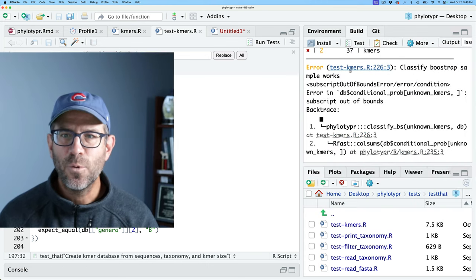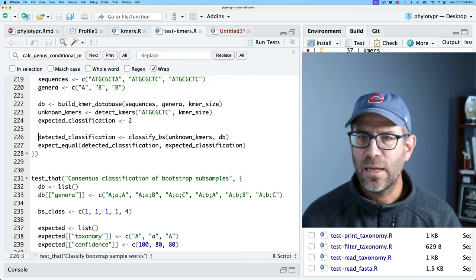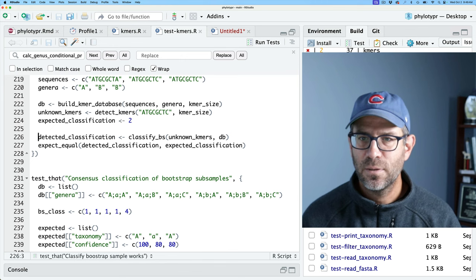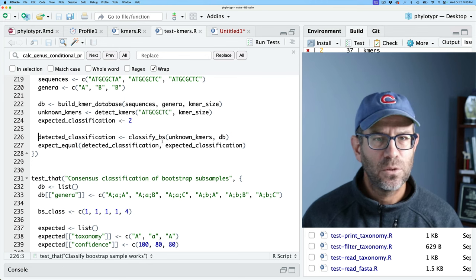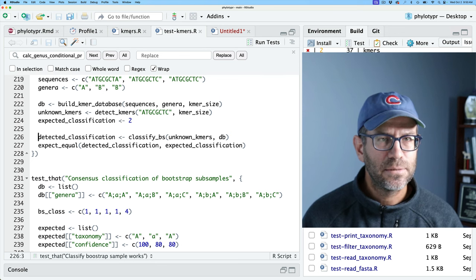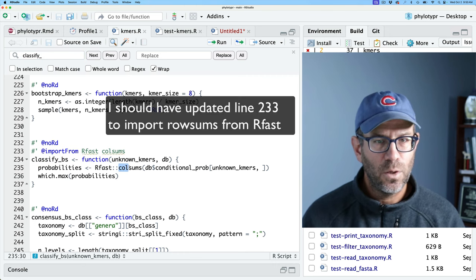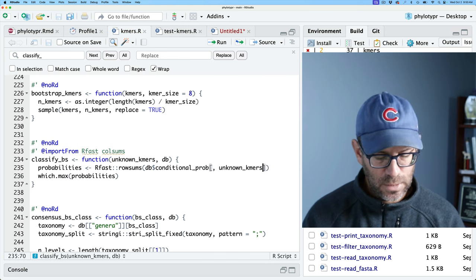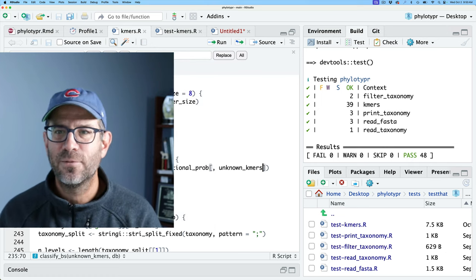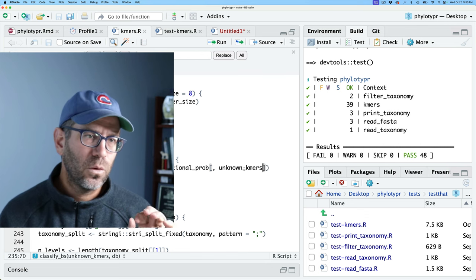Start back at the top of our errors - we're moving further down. At 226.3, detect_classification, it's saying db$conditional_prob with unknown_kmers subscript is out of bounds. That's probably happening within our classify_BS function. So we go to classify_BS - we know we want rowSums there, and that we want it to be comma unknown_kmers. Save and test. A lot of wash, rinse, repeat - just until we get to the point where our tests all pass. So that's good, and we're in good shape.